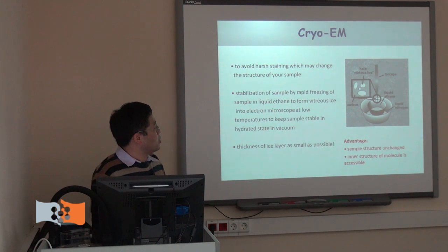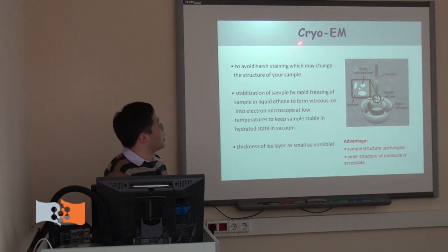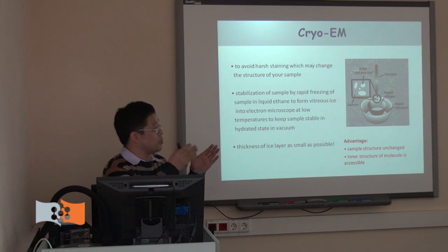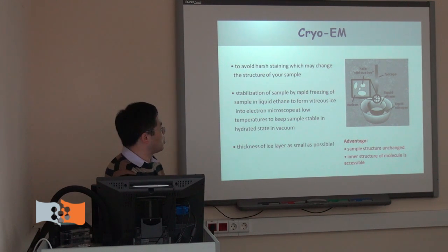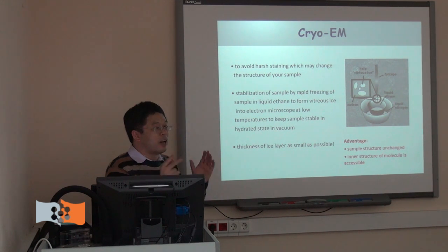In contrast, with cryo-EM we avoid the harsh staining. We don't use staining; we just apply the sample directly and freeze it, as I showed before. The advantage of cryo-EM is that the sample structure is unchanged.